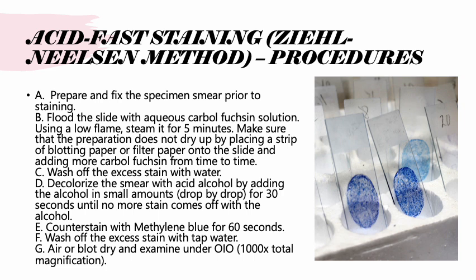Now, after doing so, you can wash off the excess stain with water. The recommended water would be distilled water. Tap water cannot be used because environmental mycobacteria can contaminate your sample.